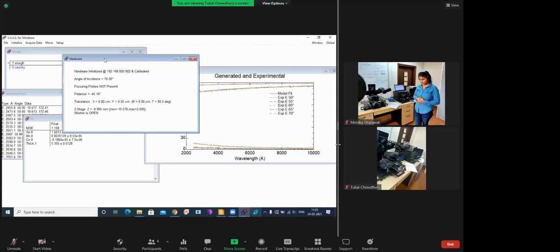I simultaneously Googled what these ABC are. If I understand it correctly, if we know n at a particular lambda, then we can get the value of k from it. Is that how we use those empirical models? Because we don't know all the things simultaneously, right? Am I understanding correctly, or is there a mistake? Can you elaborate your question? I'm not getting it.